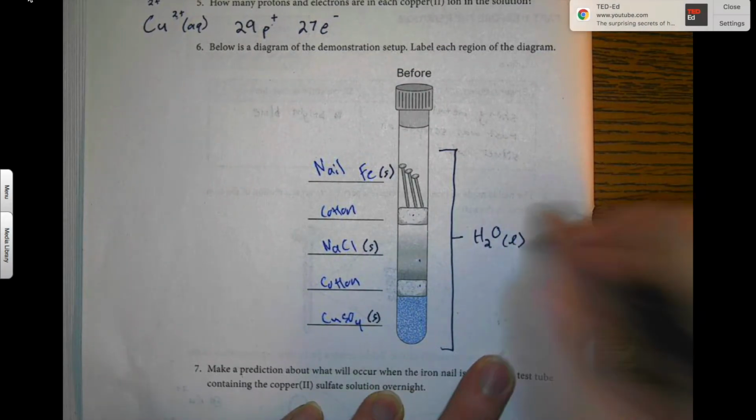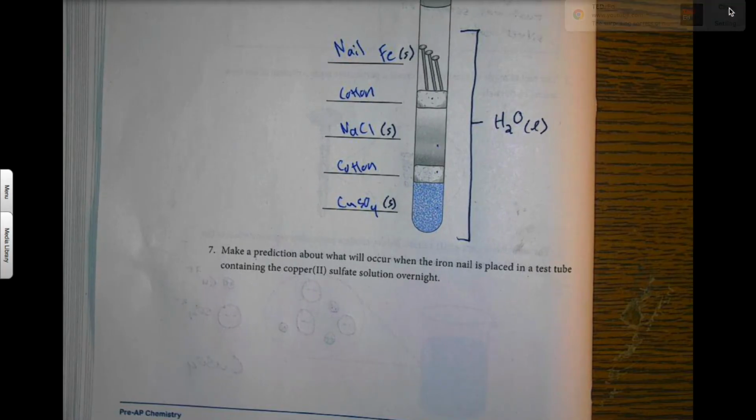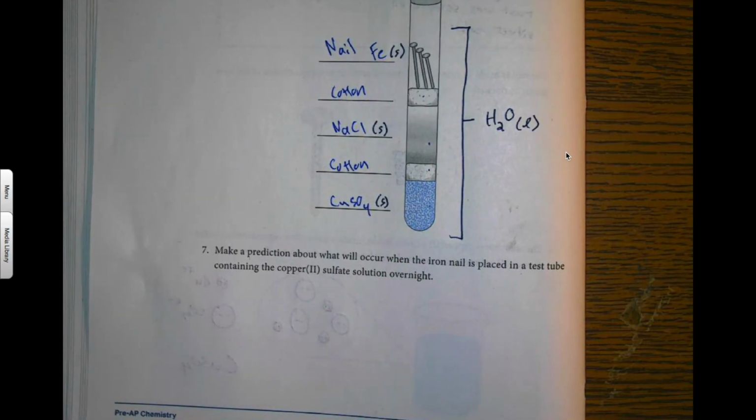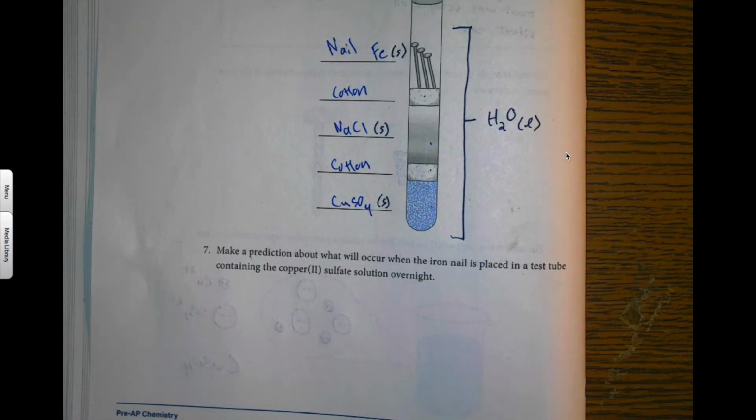and that was all liquid. And then the last one, number 7, is for you to do on your own. Make a prediction about what will occur when the iron nail is placed in the test tube containing the copper 2 sulfate solution overnight.